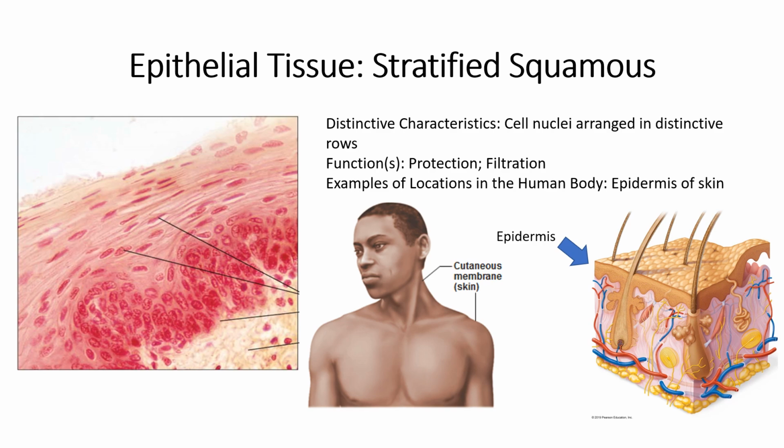Down here where the epithelial tissue meets with the underlying connective tissue, notice the nuclei down here. They're more rounded. So the epithelial cells that you see down here connecting to the connective tissue would be cuboid or cuboidal, right? But we're not worried about this basal layer or the basal row down here. We're always going to focus on the apical layer, right? So this image over here that we'll look at more in depth when we start talking about the integumentary system shows us a model of what the skin looks like.